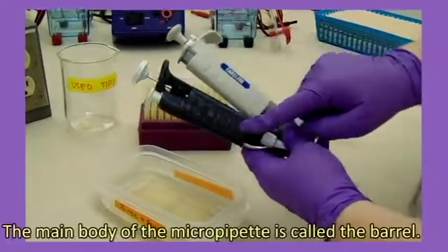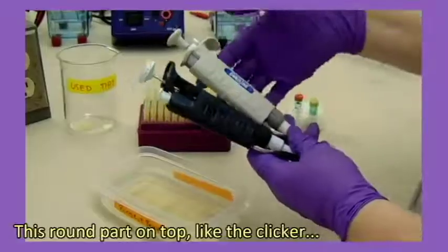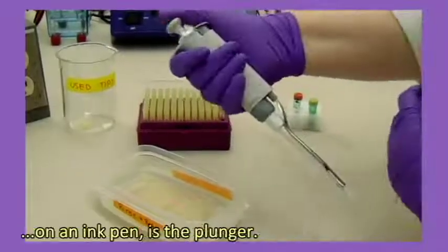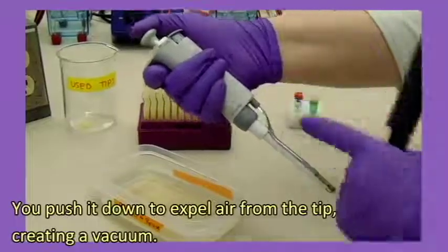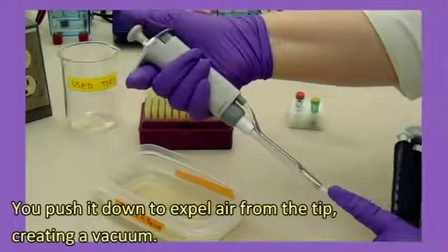The main body of the micropipette is called the barrel. This round part on top, like the clicker on an ink pen, is the plunger. You push it down to expel air from the tip, creating a vacuum.